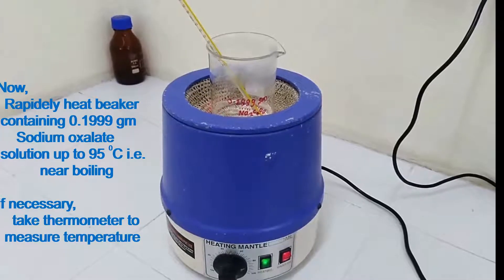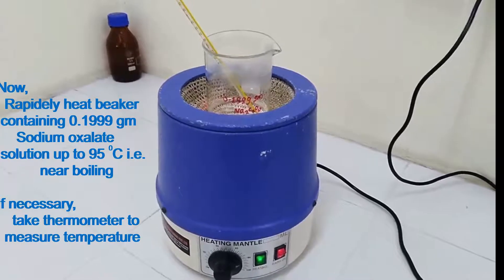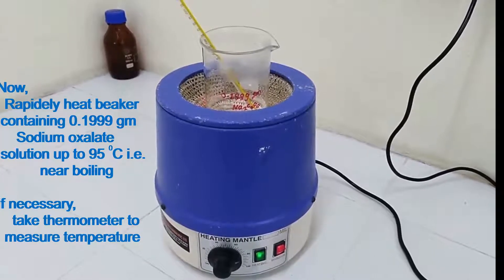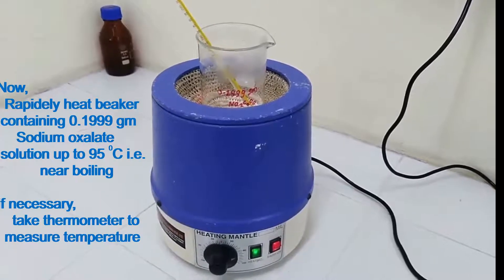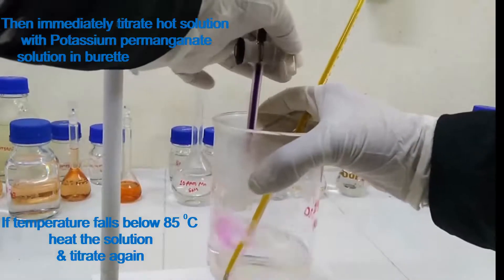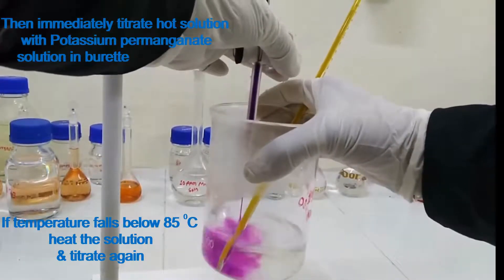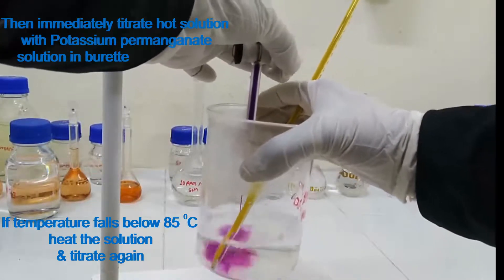Rapidly heat the beaker containing 0.1999 g sodium oxalate solution up to 95 degrees Celsius, that is near boiling. If necessary, take a thermometer to measure the temperature. Then immediately titrate the hot solution with potassium permanganate solution. If the temperature falls below 85 degrees Celsius, heat the solution and titrate again.